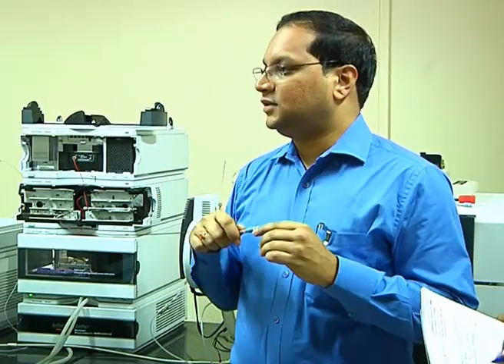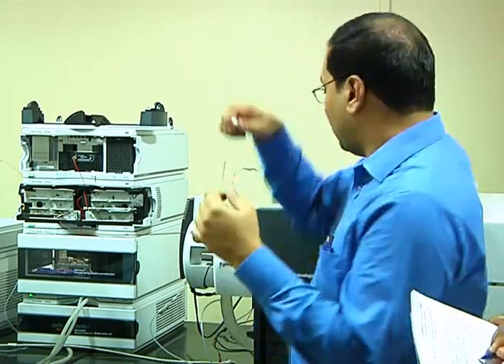Has anyone used HPLC? If you have used it, what is the readout of an HPLC? If you inject the sample, how do you see the chromatogram? Let me ask you a question. If I give you a chromatogram of an HPLC UV, if there are 6 peaks, what does it mean? 6 compounds.